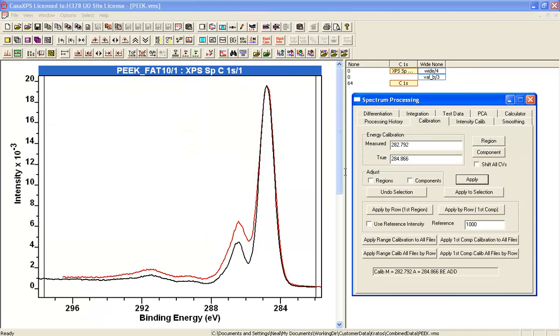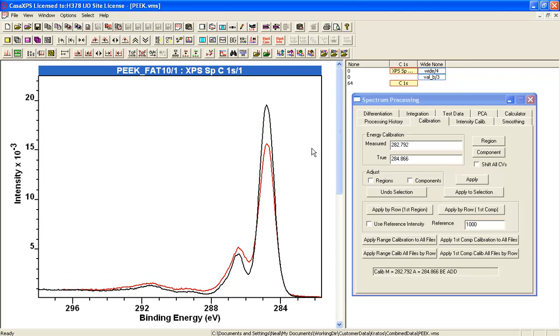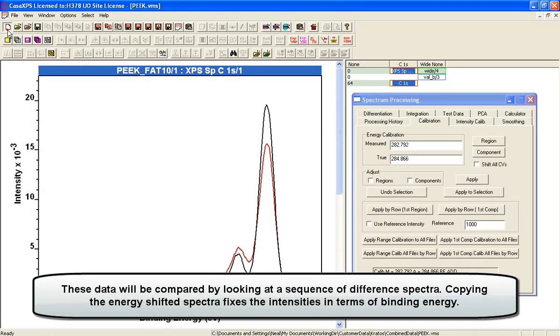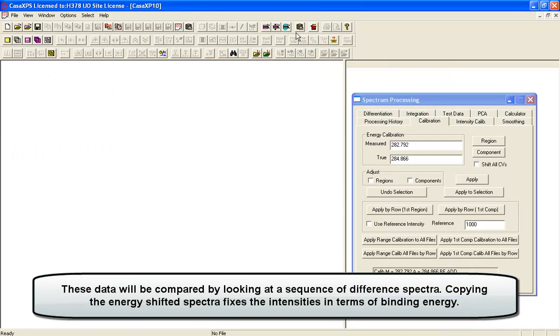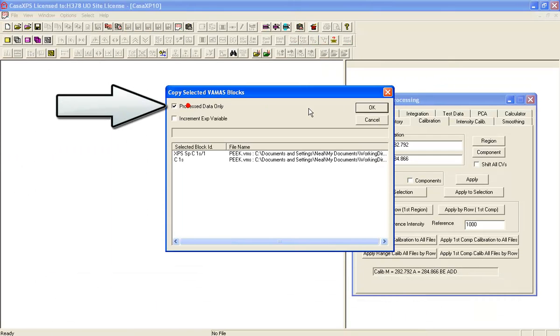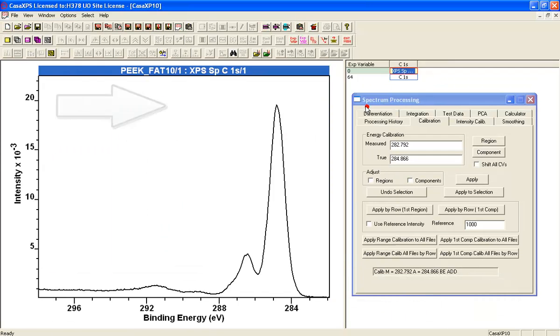So now I've got a pair of spectra that are roughly aligned and I want to see what the difference is between these. I'm going to copy these two through to a new file and I'll copy the process data only so that it maintains the calibration.